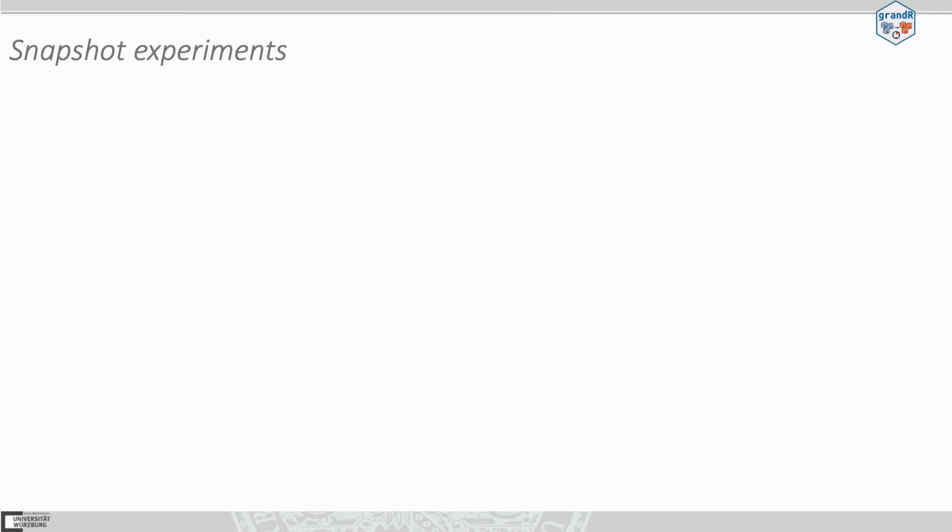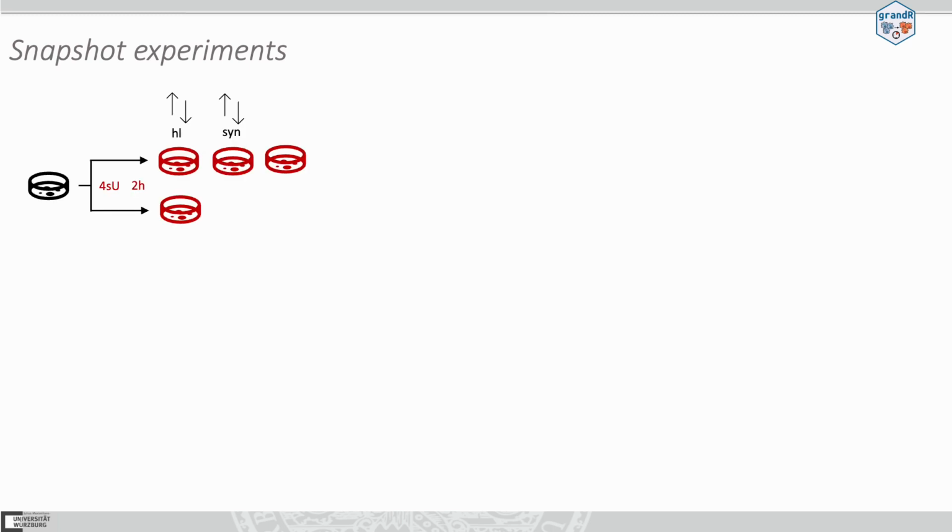But there are also applications besides progressive labeling data. Like I told you in the introduction, data from a single snapshot is already more sensitive to detect short-term changes of gene expression upon stimuli than without labeling. So we developed a statistical model to estimate degradation and synthesis rates from this type of data. To test our approach, we simulated data for 2 conditions, with 2 hours labeling. One condition is steady state, the other is either perturbed synthesis or perturbed half-life or unperturbed control.